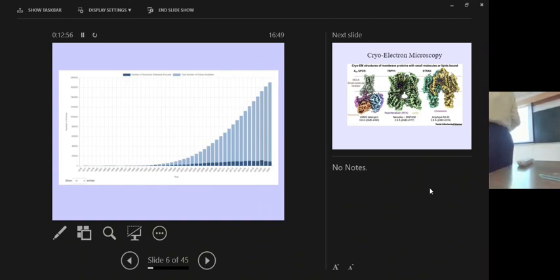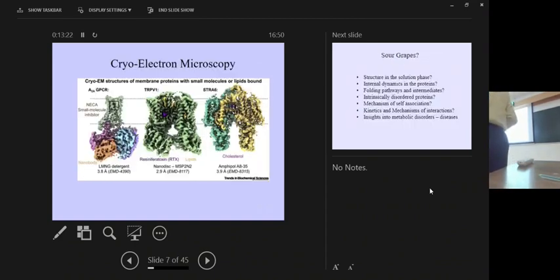So you have seen this started somewhere in the 1970s. There were only one or two structures. And today you have 140,000, 160,000. How much is it? 180,000. About this, 170,000 structures deposited into the PDB. So many structures have been determined. So clearly it's an extremely powerful, extremely useful technique for determination of the three-dimensional structure of the molecule.